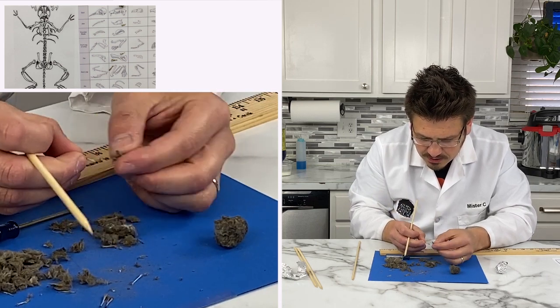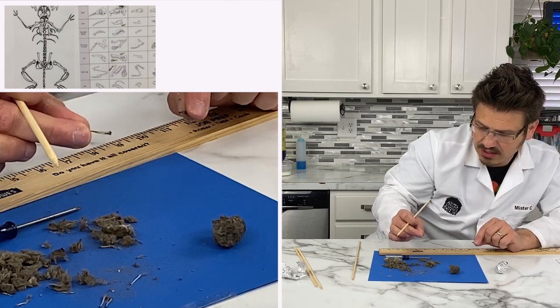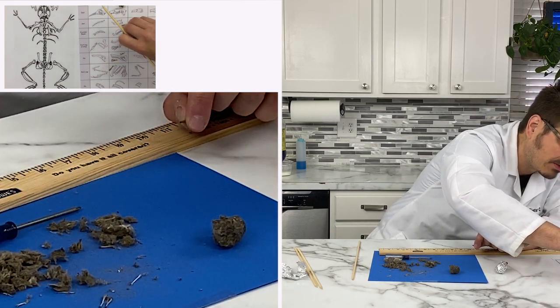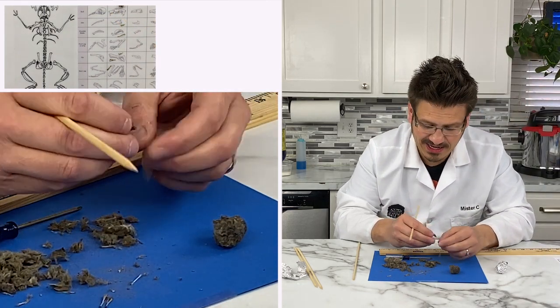Here's another. Oh, look at that. That's cool. I want to say that's a shoulder blade. It looks very similar to a shoulder blade.